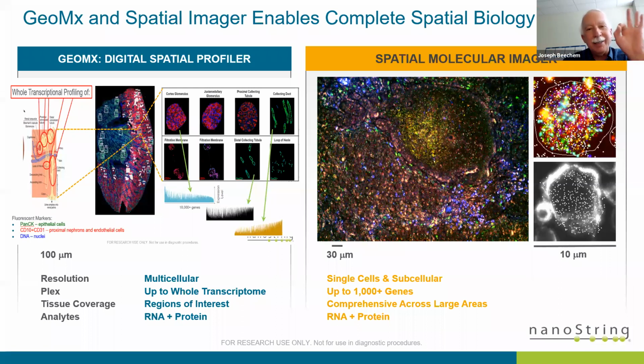I'm getting whole transcriptomes exactly where I want them. And then you get shapes that are really unusual, like you can see the collecting ducts. You need whole transcriptomes on those shapes. They're easy to get, and so on and so forth. And I really do think you can recapitulate literally 50 years worth of research on a single pass of transcriptomes on a single tissue slice.